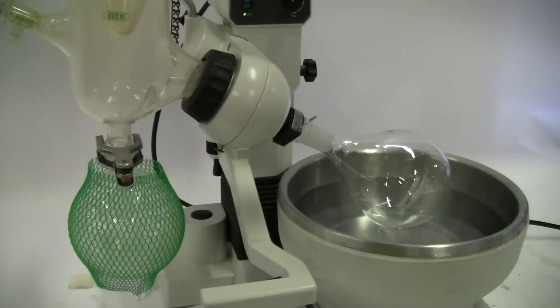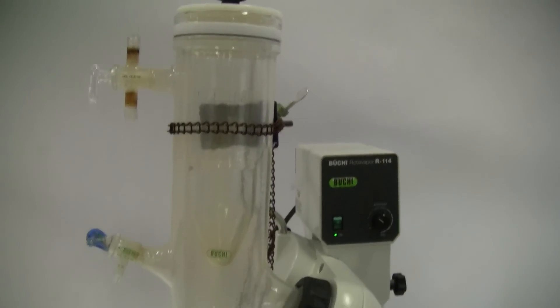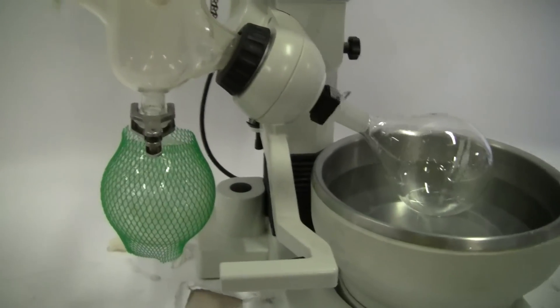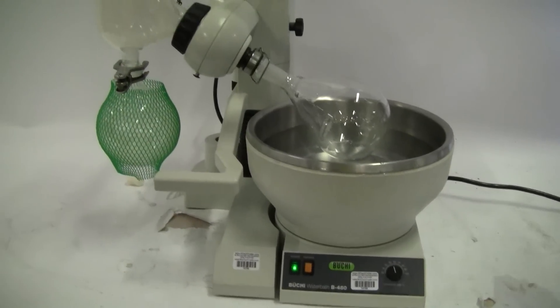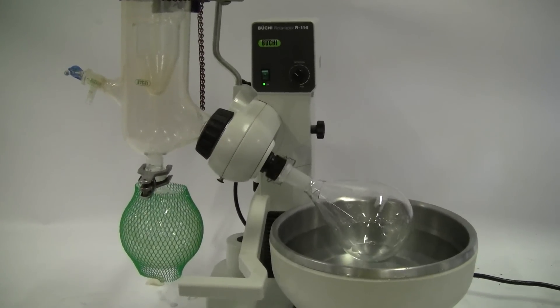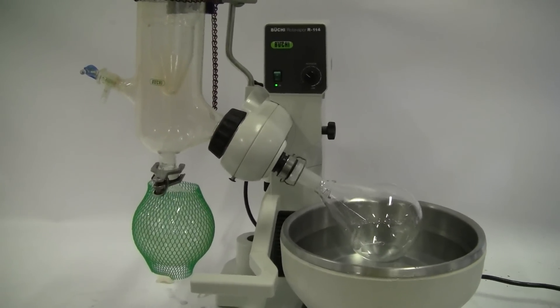Other than that small piece, the rest of the unit is nice and intact. This piece is going to be replaced before this unit is sent out of our facility. If you have any further questions about this unit, please don't hesitate to call us at 609-518-9100. Thanks again from HiTechTrader.com.